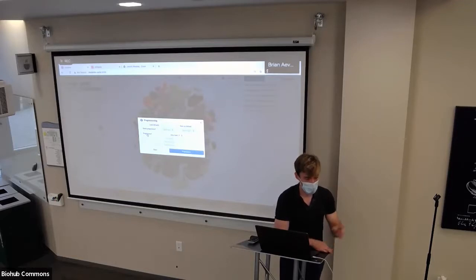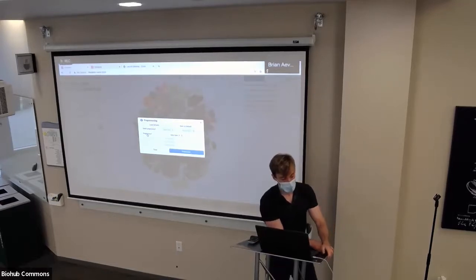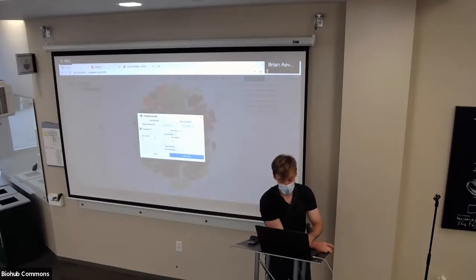And I'm not showing all parameters. I cherry picked the ones that I thought would be most often tuned. So that's a little bit of subjectivity on my part. Most users, like I said, though, would not want to actually touch the re-embedding parameters. Maybe for pre-processing, they would tune these a little bit. Although the one downside with the current implementation is that without a histogram, it's really hard to select the proper threshold.